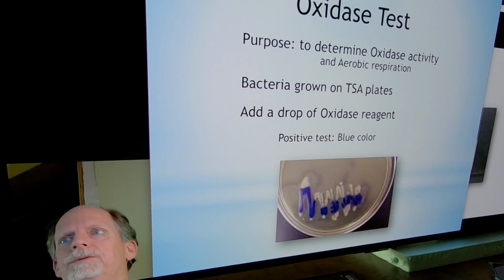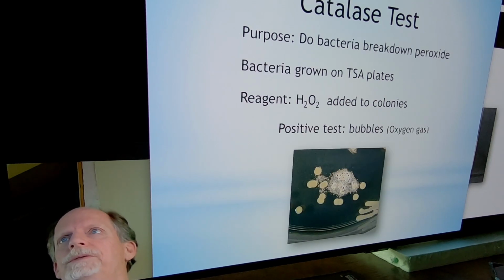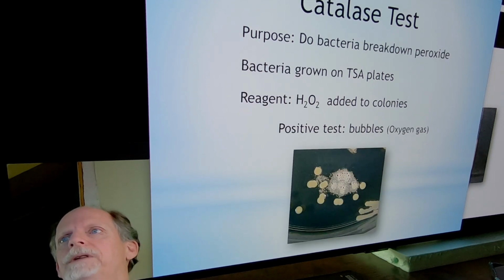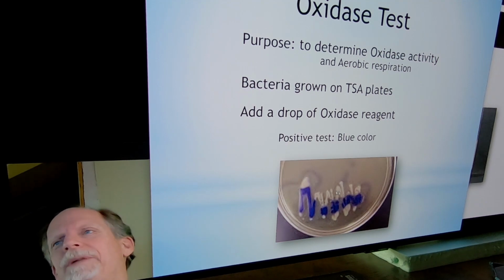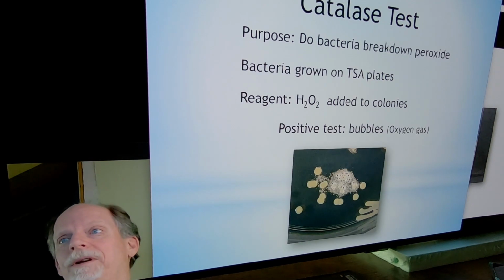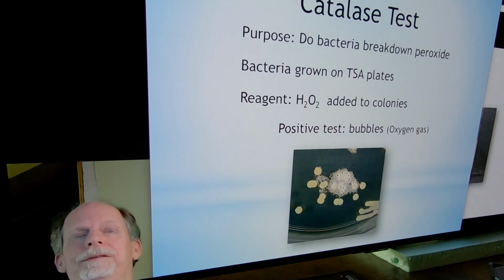TSA plates are used. Some people get these two confused, the oxidase and the catalase test. Okay, you use a TSA plate. You can put the bacteria on anything really, and then add oxidase to do the test, or add peroxide to do this test.